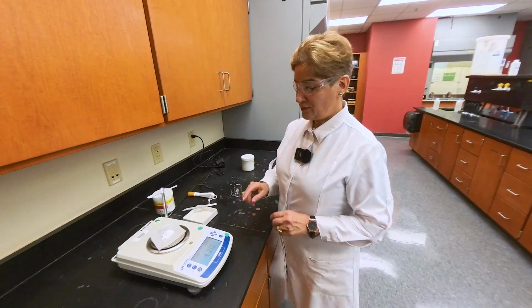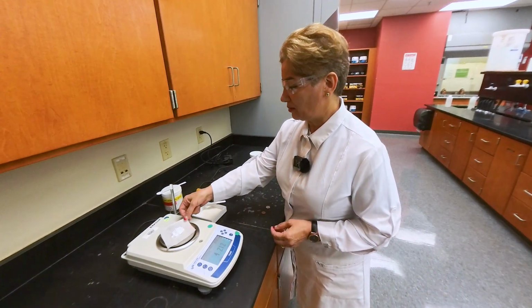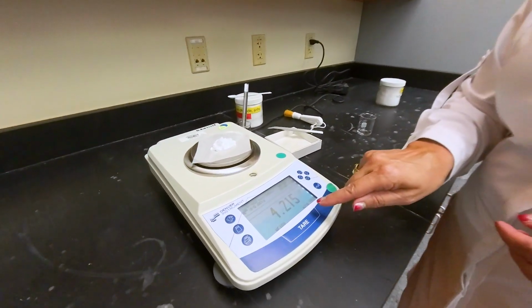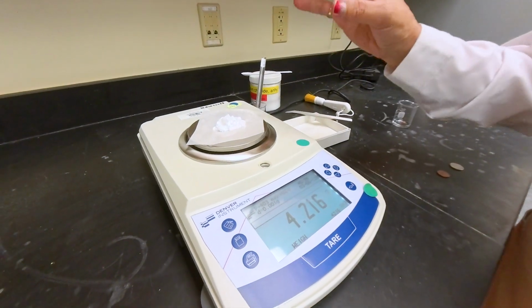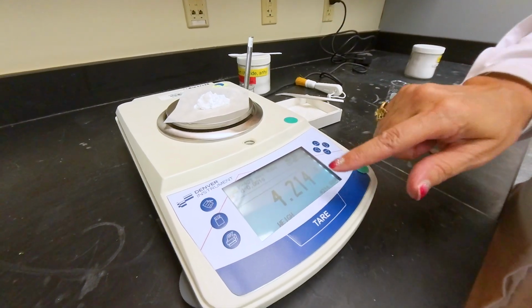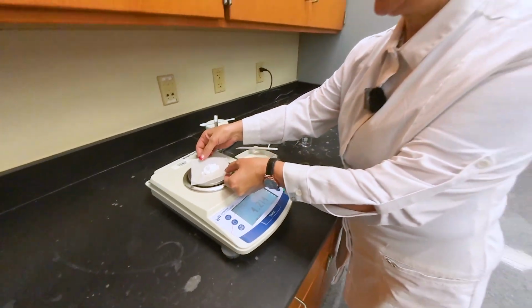Okay, we waited for 15 minutes. Now the calcium chloride, which is an anhydrous agent, has absorbed water. Now you look at this number, the mass has increased. I didn't change this sample. It was just the moisture absorbed by the calcium chloride that increased the mass. And we are done with measuring the mass.